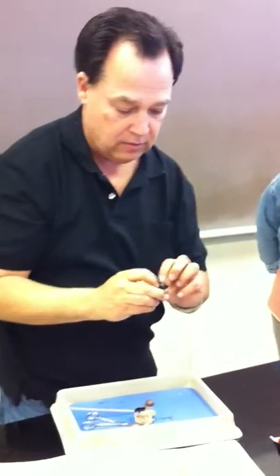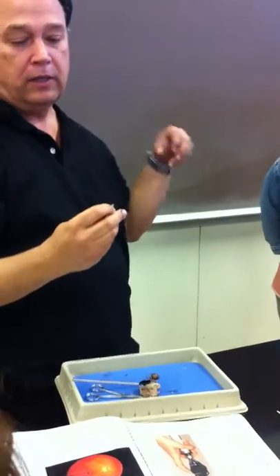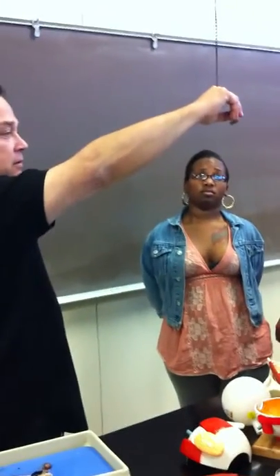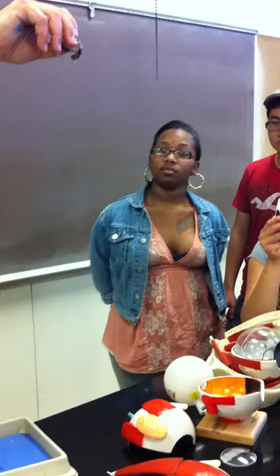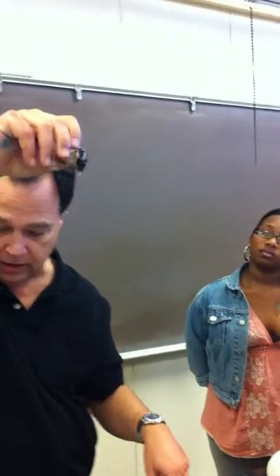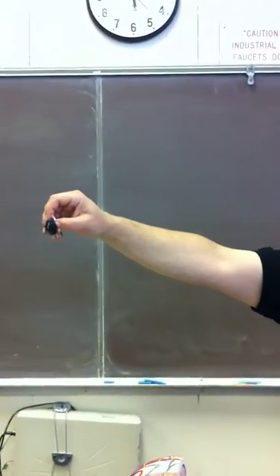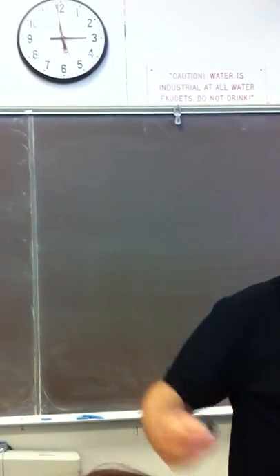And from the other side, I'm actually going to fold this out so we can see it real well. You can see the pupil and see the cornea through it. But also, you see this black structure with the lines on it? That black structure with the lines on it is the iris. And the little lines, those are the suspensory ligaments. The suspensory ligaments were where the lens was originally attached. So originally the lens fit right in there attached to those lines.